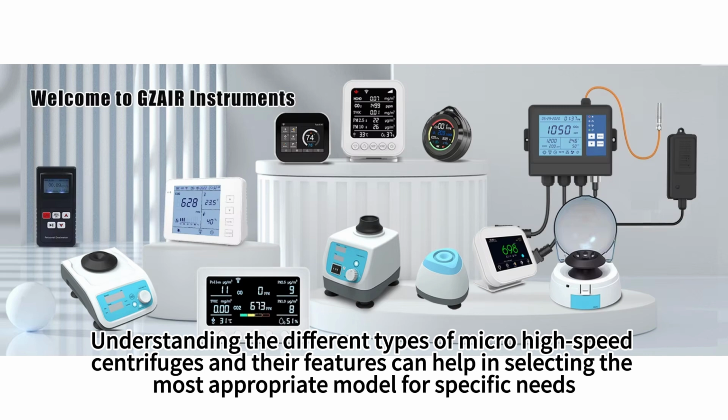Understanding the different types of micro-high-speed centrifuges and their features can help in selecting the most appropriate model for specific needs.